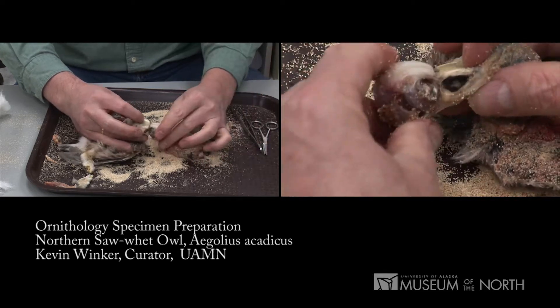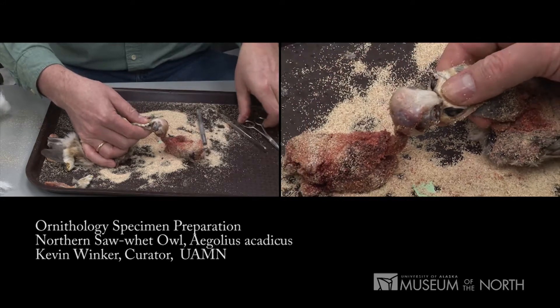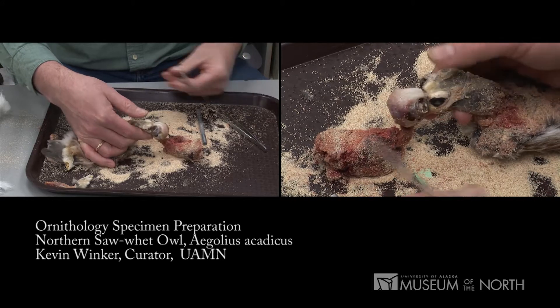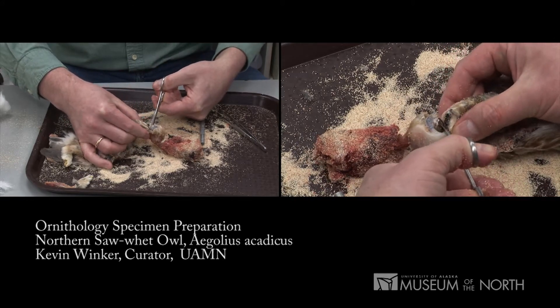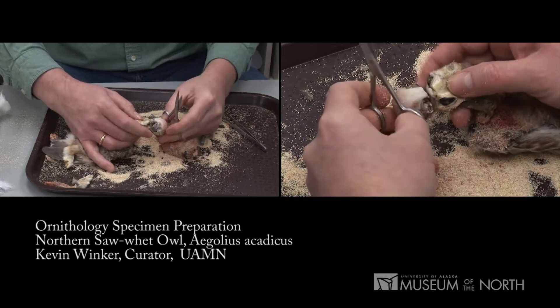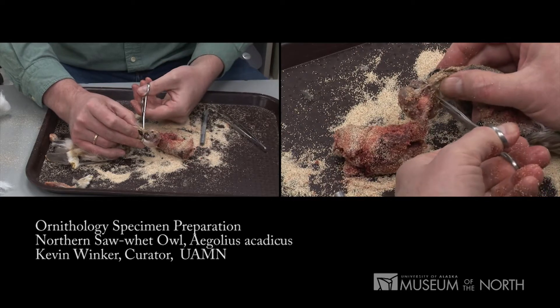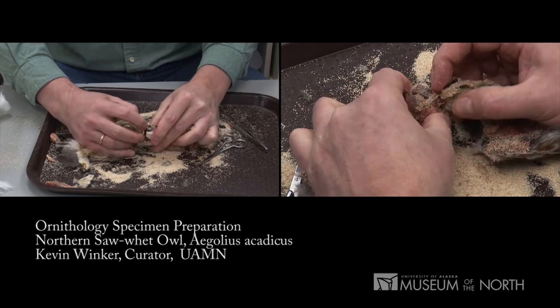I've removed the body from the skin to the base of the bill. At the base of the bill — this is a method we use when doing skins and partial skeletons — I'll cut three cuts from the top of the skull, down across the eye sockets, and then from the base of the bill, one on each side, to sever the jaw from the rest of the bill.